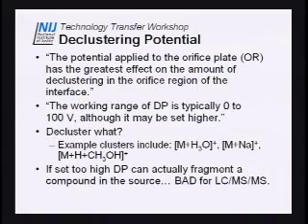What's happening is sometimes your molecular ion gets tied up with some hydronium ion, or maybe some cation that you don't want, or maybe some sort of weird combination of hydrogen and mobile phase. What you want is M plus H. That's it. You don't want M plus mobile phase. You don't want M plus hydronium. You want M plus H. Tweaking the declustering potential, applying a little bit of potential.